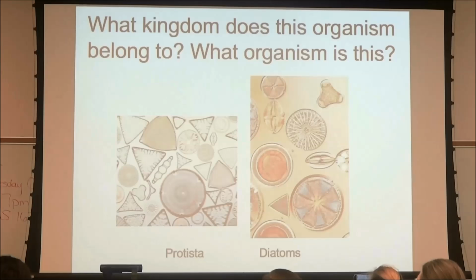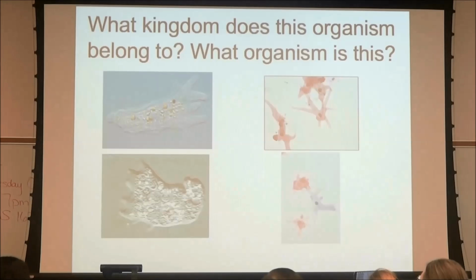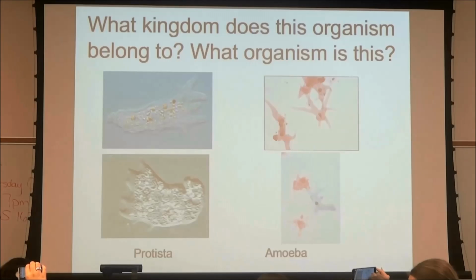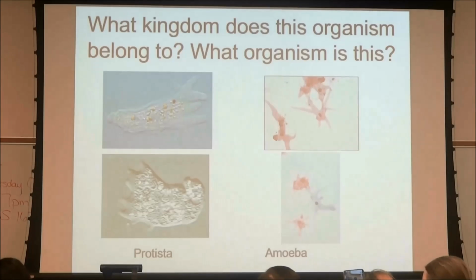Yes? Yes. Okay. What is this? Amoeba. This is the amoeba. How did you know that, Susan? Because it moves. Well, it's not moving in the picture. It's those legs. I just remember the pictures. What are those legs called? Or feet?